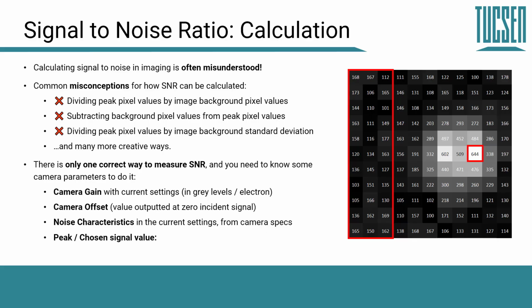And this is important to mention because one thing that I've slightly glossed over so far is that in fact every pixel of an image has its own signal-to-noise ratio value. Of course, every different pixel has collected a different amount of signal. That's actually what our image represents, different signals across the pixels. And of course, different signals means different signal-to-noise ratio values. So the question is, when we talk about an image having a certain signal-to-noise ratio, what do we mean? What's useful for us to mean?